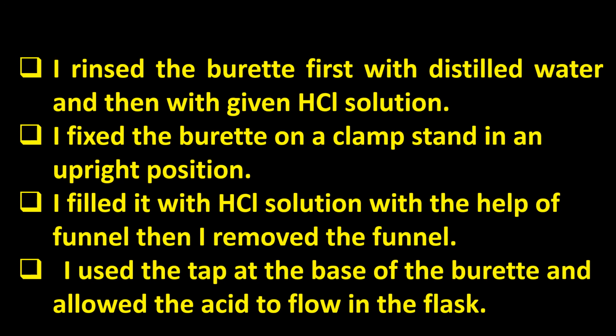I use the tap at the base of the burette to allow the acid to flow into the flask. And please memorize that you can easily control the tap yourself, so please open the tap very carefully and very slowly, so that the acid is dropped into the base one by one, okay? Just drop-wise. It should not be a whole flow of liquid moving into the base. No, you have to add it drop-wise, one by one.